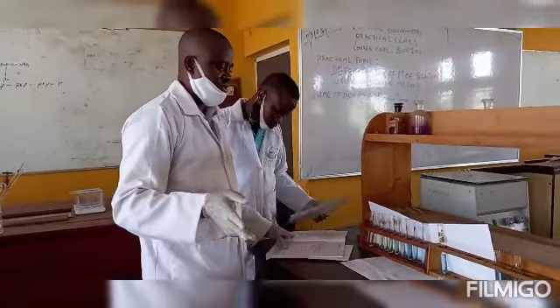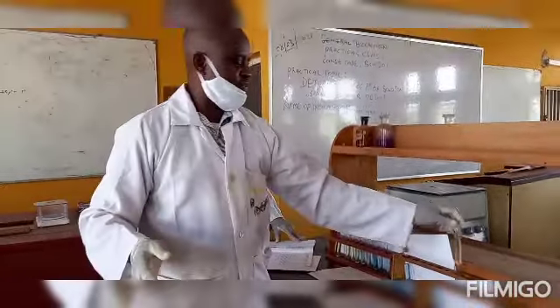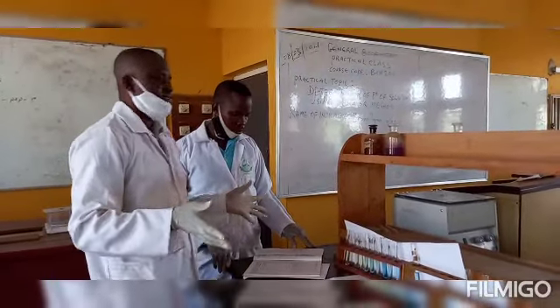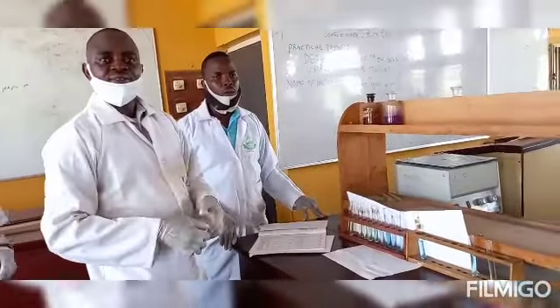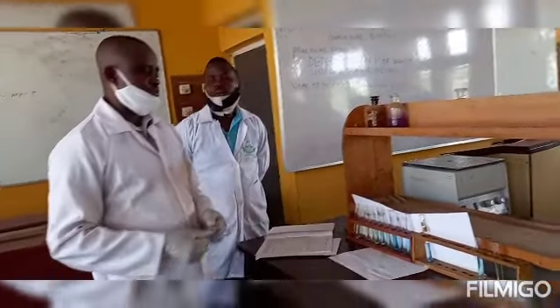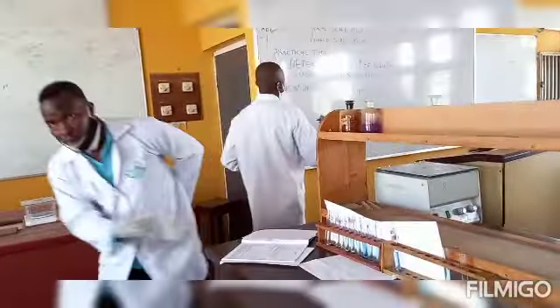Now the question is that our urine sample has a pH of 6.2. What type of pH is that? Is it acidic? Is it neutral? Is it alkaline? Is it slightly acidic, slightly alkaline, and so on? So from our pH scale, that's what we call the pH scale.